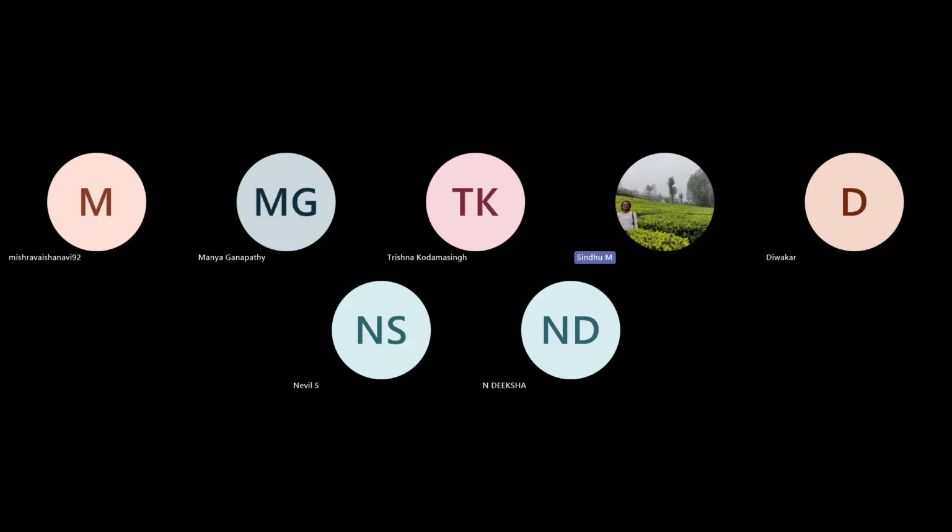So till now we were at how to use the ROI manager and the measure function to analyze different cells or other structures within the images. So now let's look at some of the other basic things of using Fiji.